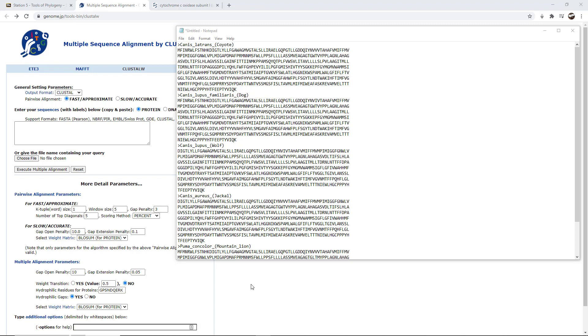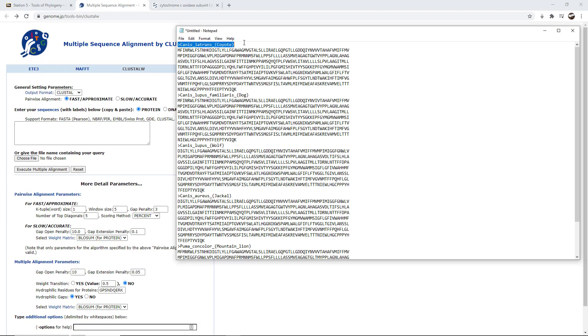In the previous video, I showed you how to find information from GenBank and download it into the FASTA format. Here's my notepad. You can do this in Microsoft Word as well, but basically we're going to copy and paste this information anyway, so it doesn't really matter where you store this information as long as you can have it in the FASTA format. Remember, the FASTA format starts with this greater than symbol, then has a label. There can be no spaces in it. That's why there's the underscores.